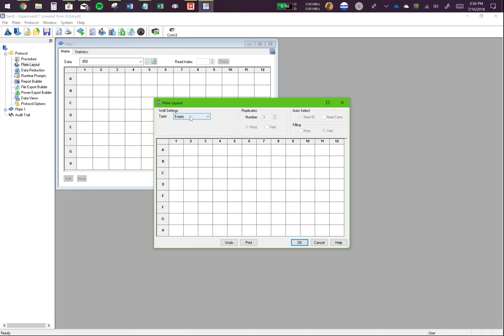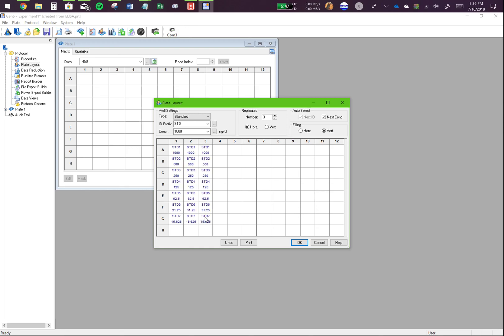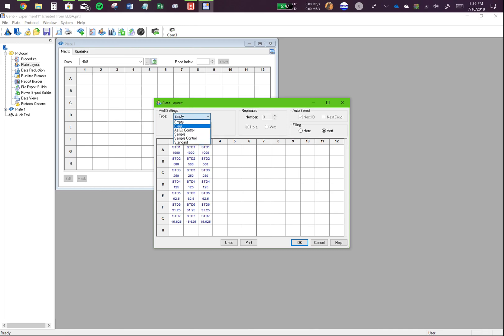So we are going to go for standard and we're going to make sure we click on next concentration. So, after every three wells, it will automatically select the next standard. And here. Now, let's say if I had these last three wells as blanks, so I'll also put that in.